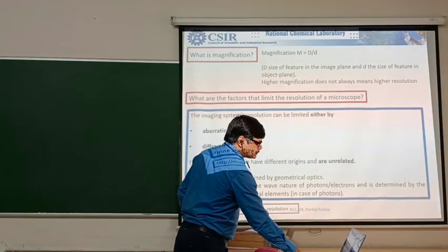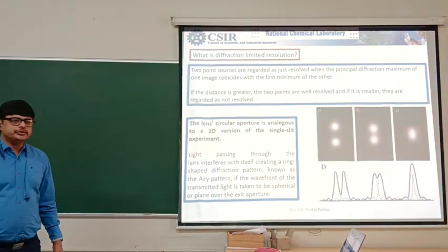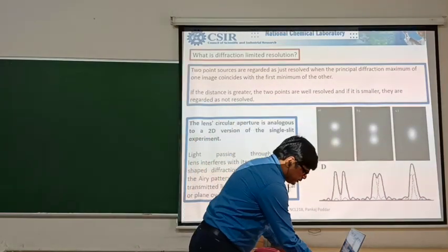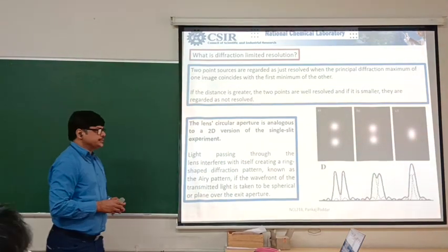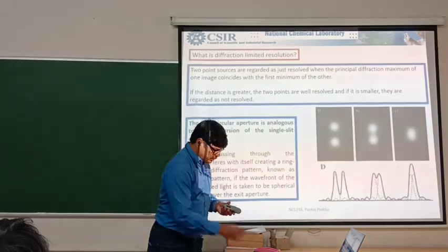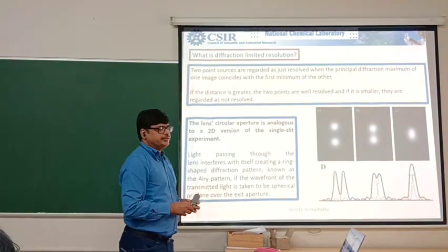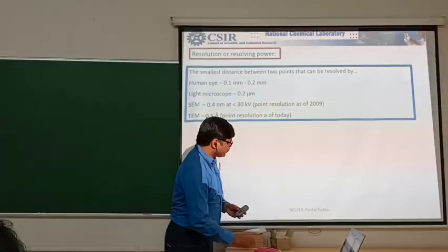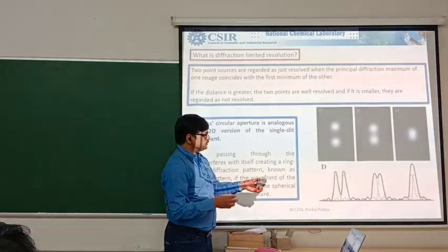Now, the next slide comes to you. So, how do we define it mathematically? I will not go into the mathematics. I promise you, I will not go into the mathematics. But here you can get a fairly good idea. So, two points, and this will help you in question number one. Not necessarily do you need this idea, but we say that two points are resolvable only when... So you can see that there are three pictures here, right?